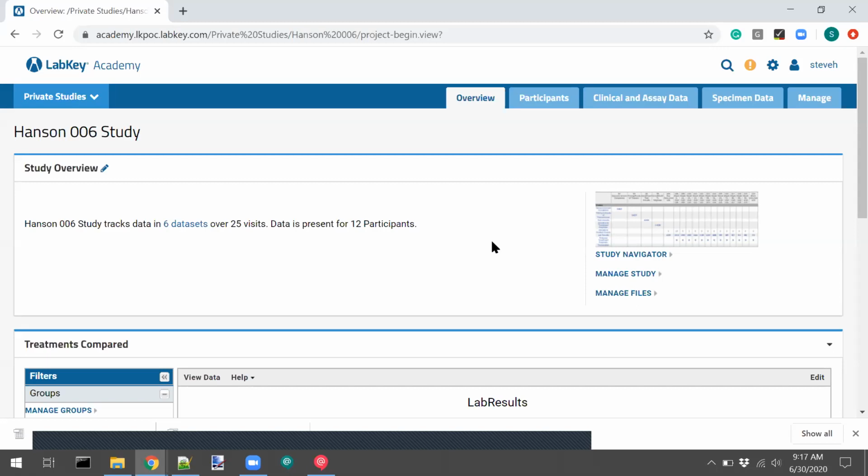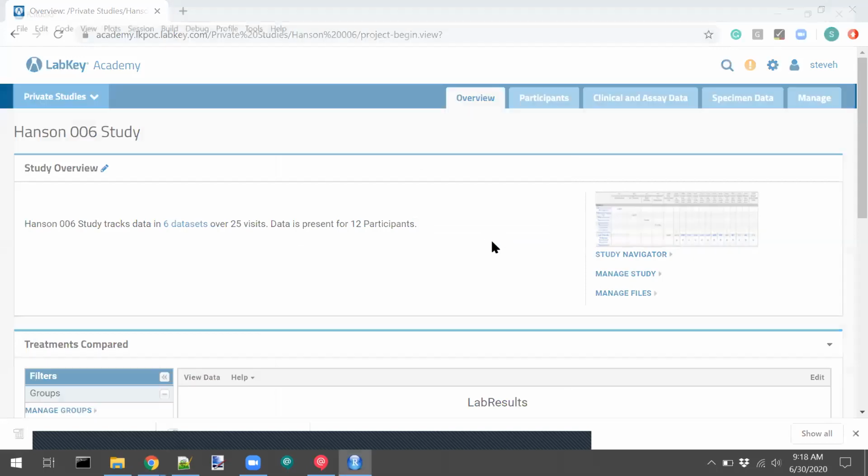Okay, well, I thought I would maybe round this out by, I know there's a lot of data scientists out there, and I think it's really great. I think the coolest demo I didn't get to do was the RStudio demo. I have RStudio installed on my local machine, and I thought I would open it up.